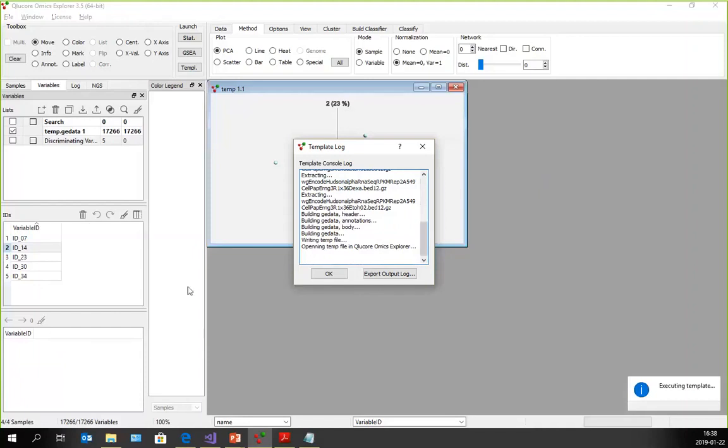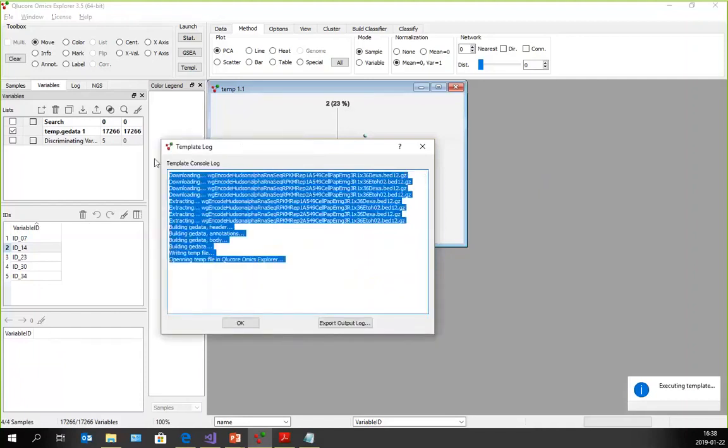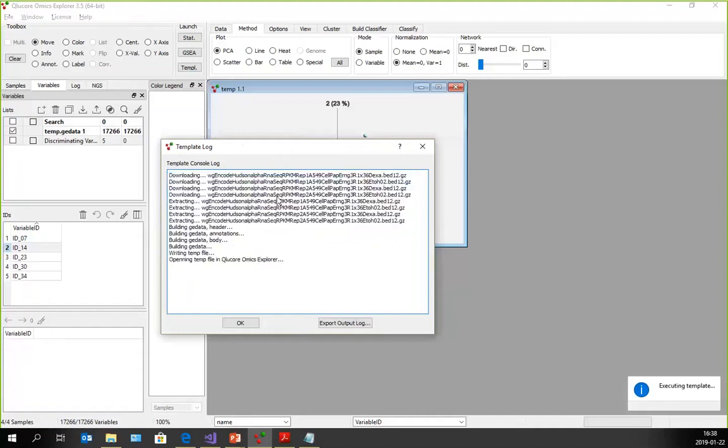And this is really what happens here, because this is the console log from the FTP download, because the FTP downloader writes texts telling me what it downloads and what it's doing. So debugging can be done not interactively, but very simple printouts can be done, and there is another way of running this, which I'll show you in a moment.